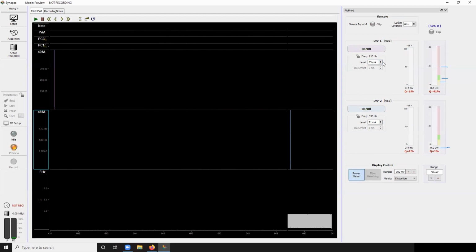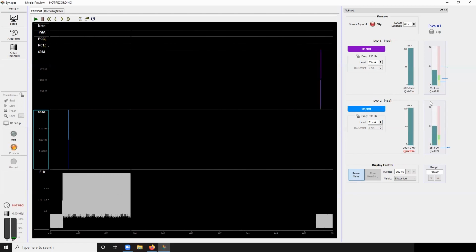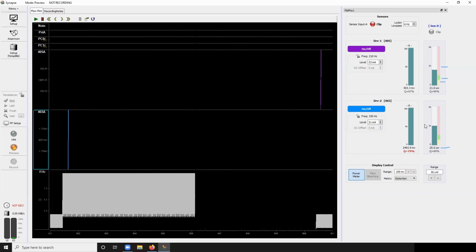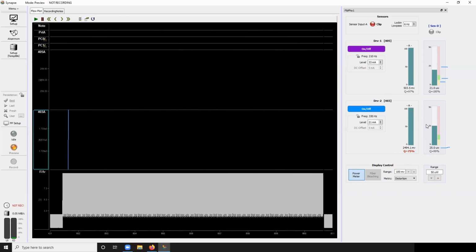One thing I want to talk about real quick is this Q factor, this quality factor. What that's measuring is basically the amount of return fluorescence that you're seeing at that particular driver frequency. So with the Q factor of 99%, what you're seeing is a really nice, clean 330 hertz signal, and that the signal to noise, so the background noise is a certain amount, and then the 330 hertz content on that signal is much higher than the background noise.